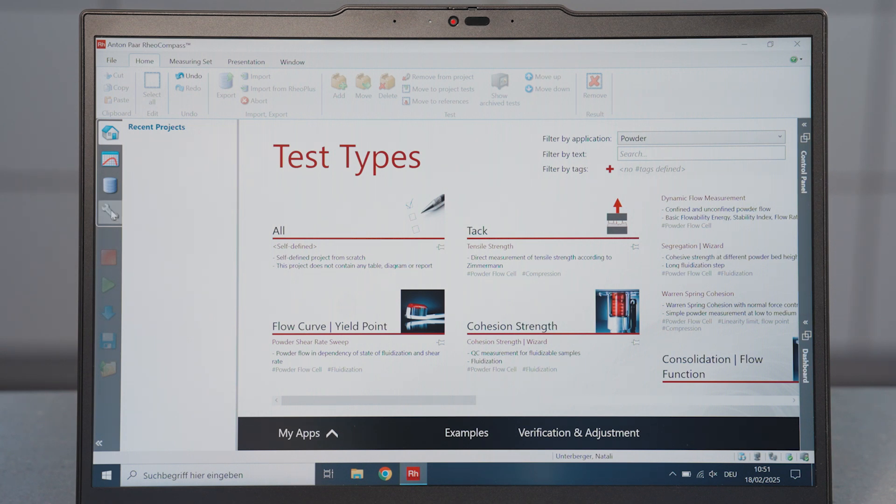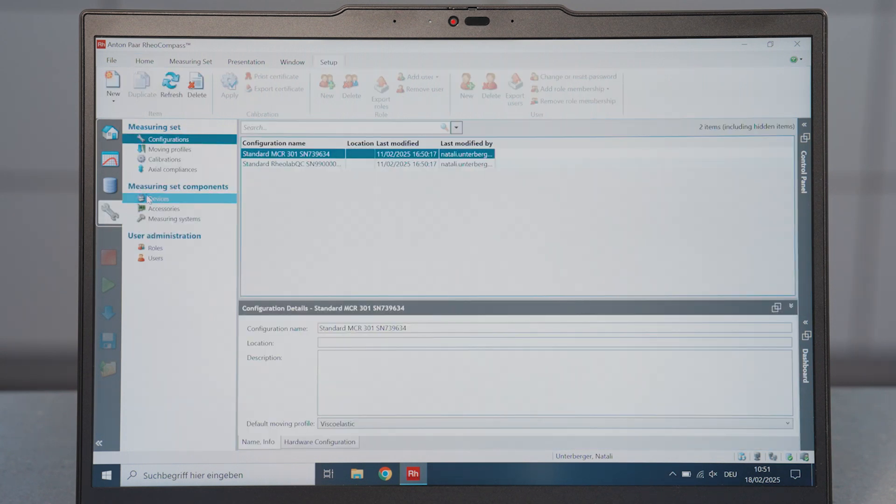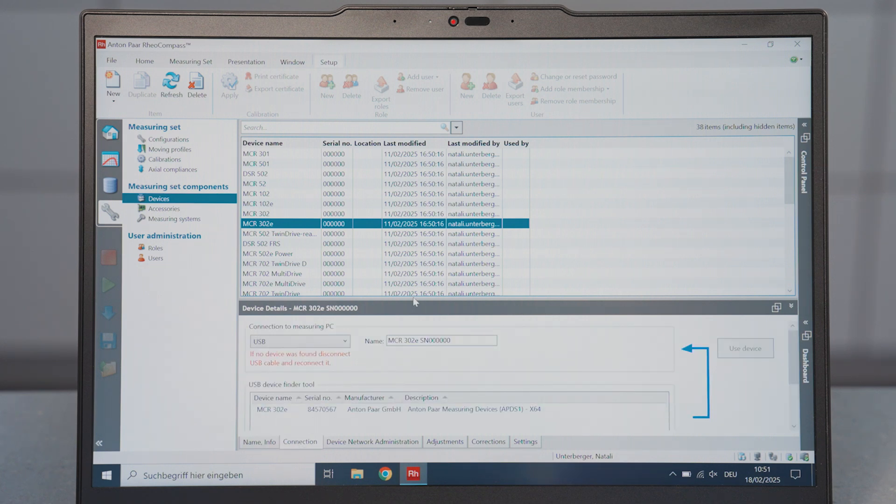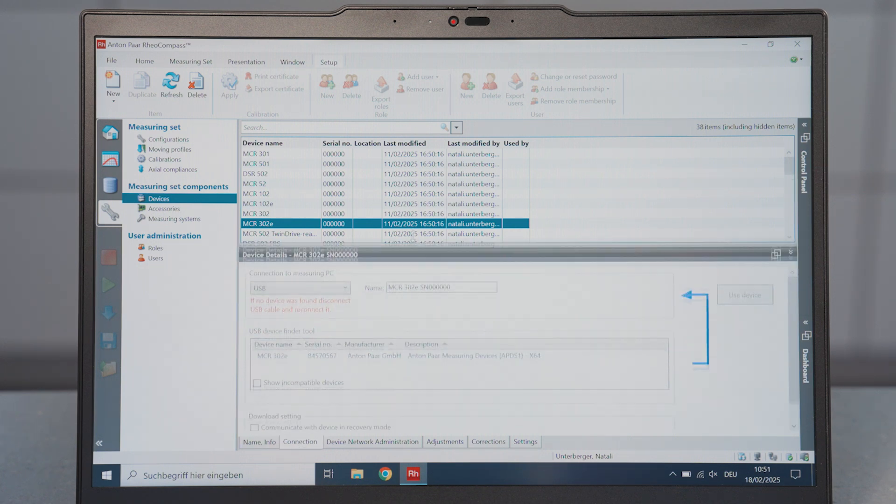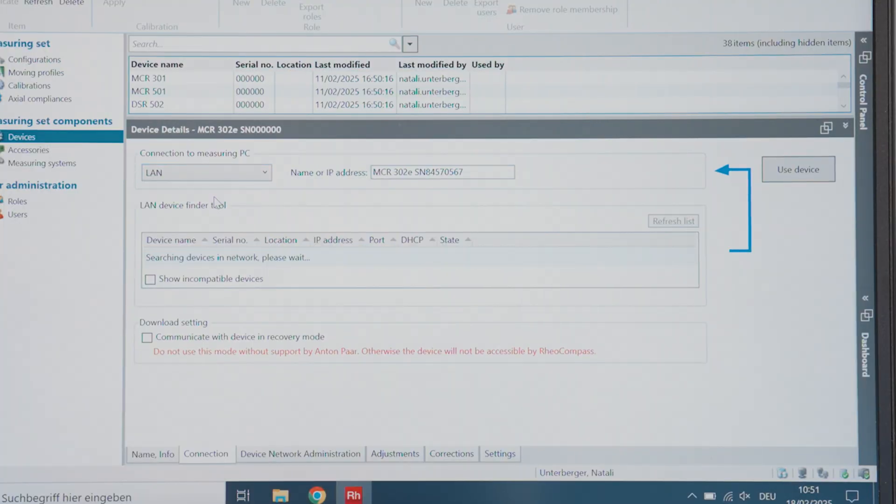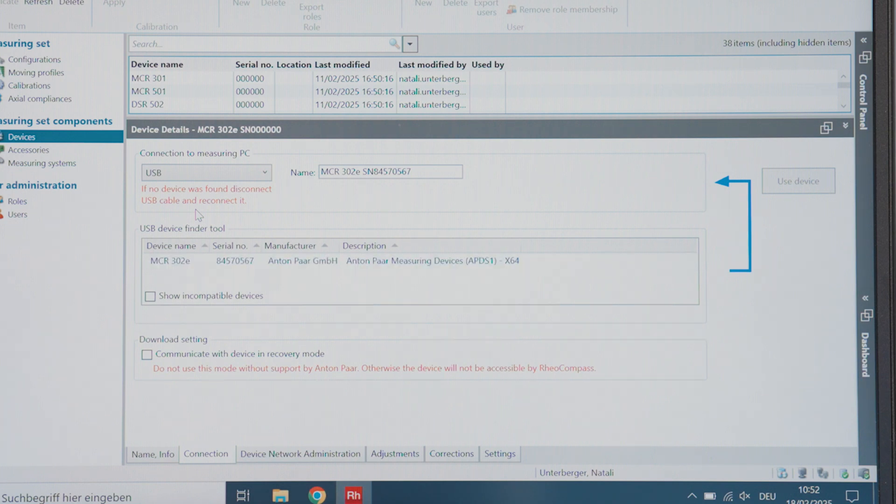Go to Setup, then Measuring Set Components, then Device, and select Rheometer Type. Select the Type of Connection. Once a connection has been successfully established, click on Use Device.